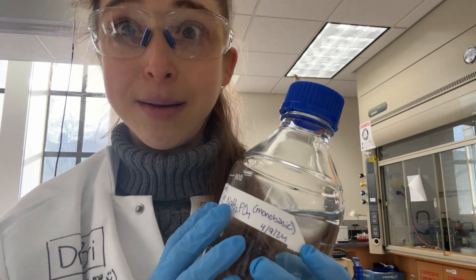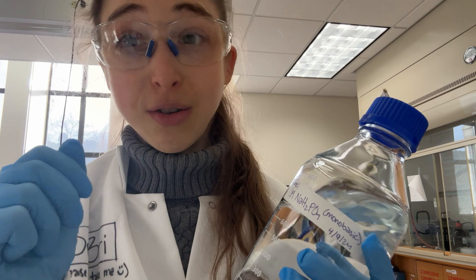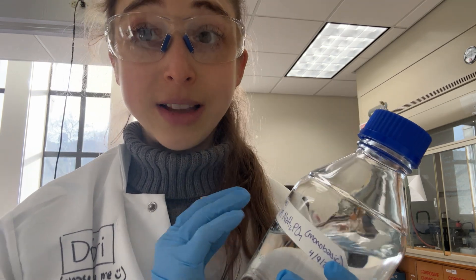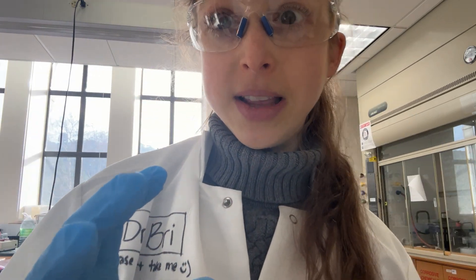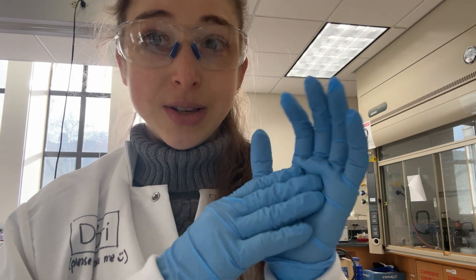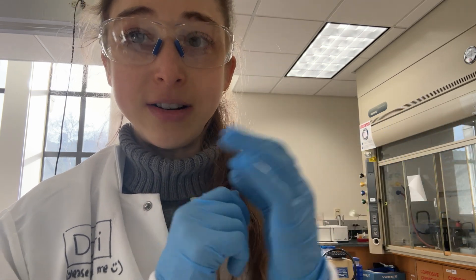Sometimes you might also find that the marker on the label is halfway off. If you're dealing with something like ethanol or some sort of solvent, your normal Sharpie is not going to do the trick unless you have some protection over it. If you have a solvent-proof marker, that's great. If you don't, what you can do is take some big clear packing tape and put it all the way around to seal it up, so that if solvent drips on it, it doesn't wipe the text off — at least not initially, though it might later seep in.